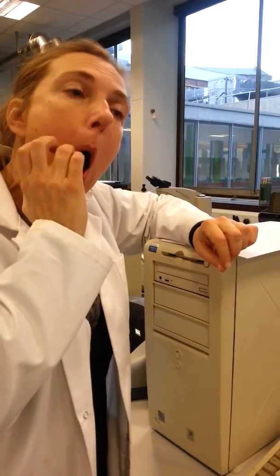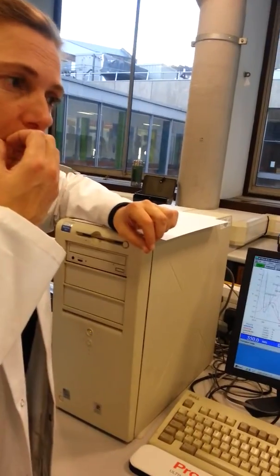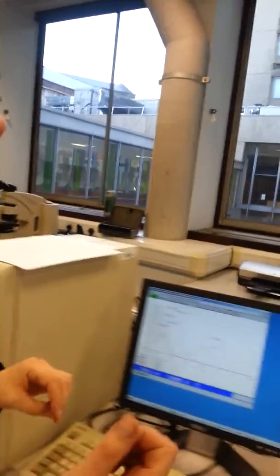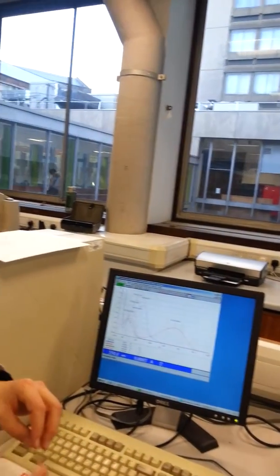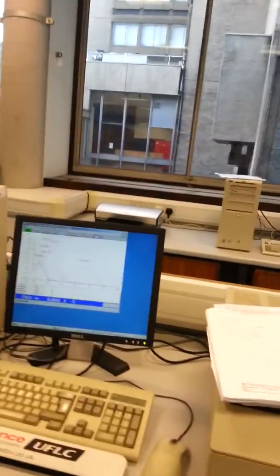We've not got much left of our diluted. Look, we've got literally... Oh, it's enough to inject. You just need a... Oh, you've been chucking it away, have you? Yeah. Sorry, it's just an injection, isn't it? So it should be... Yeah, alright. You only need about 60 microlitres. Oh, that should be alright then.